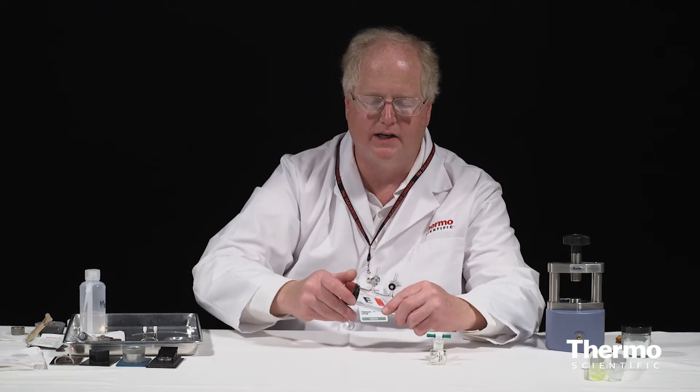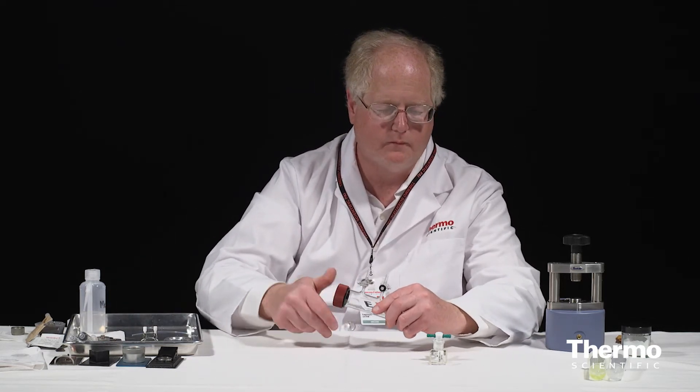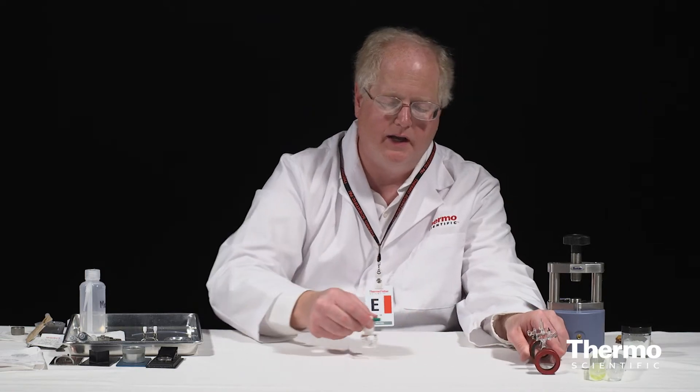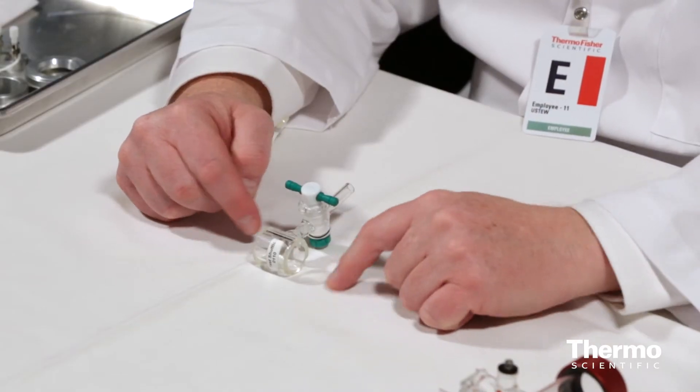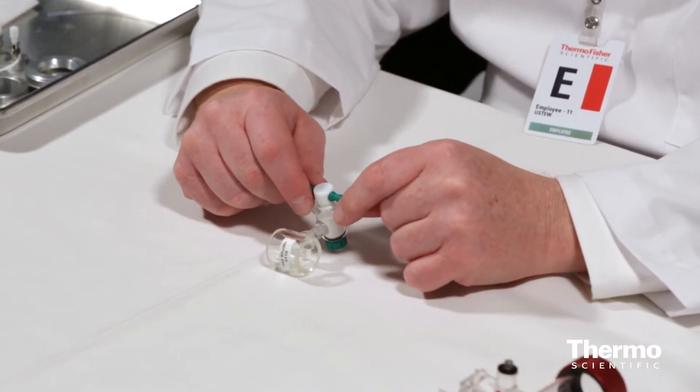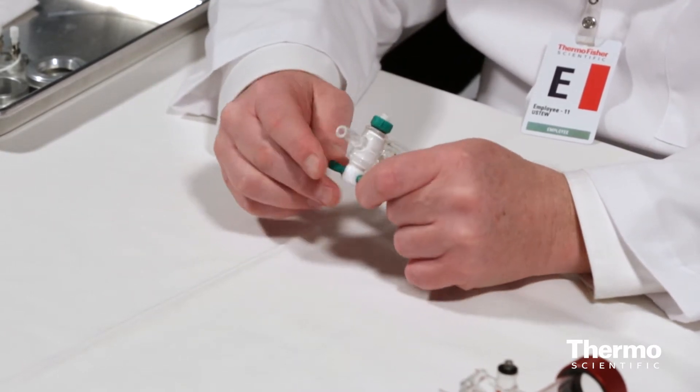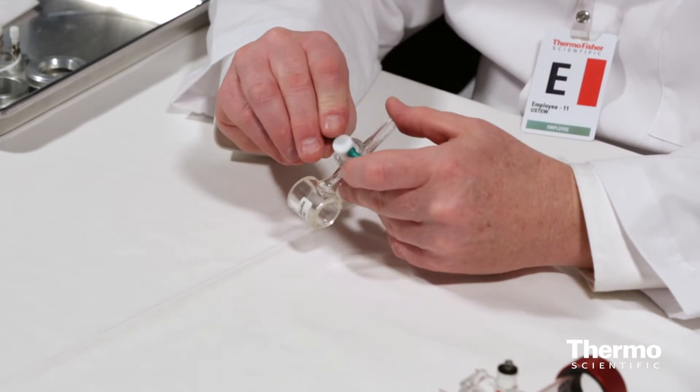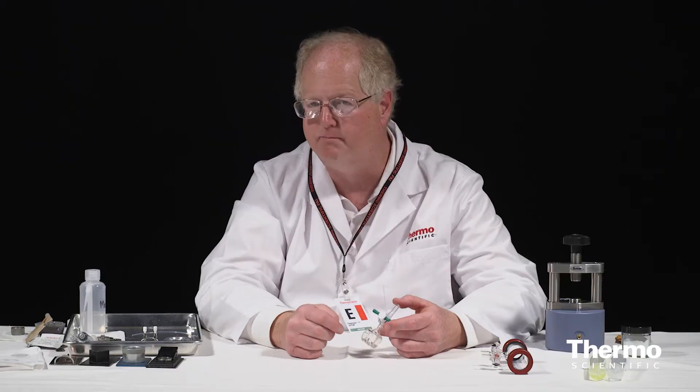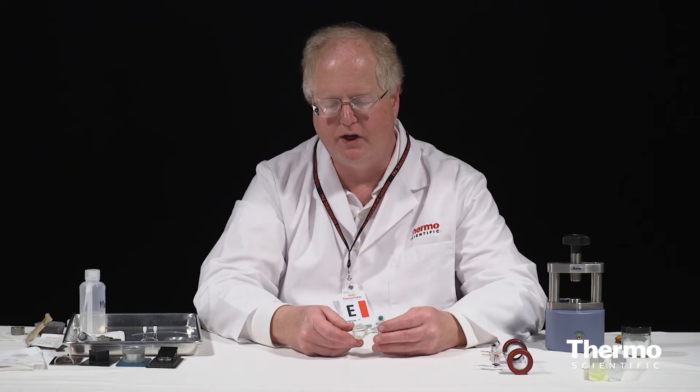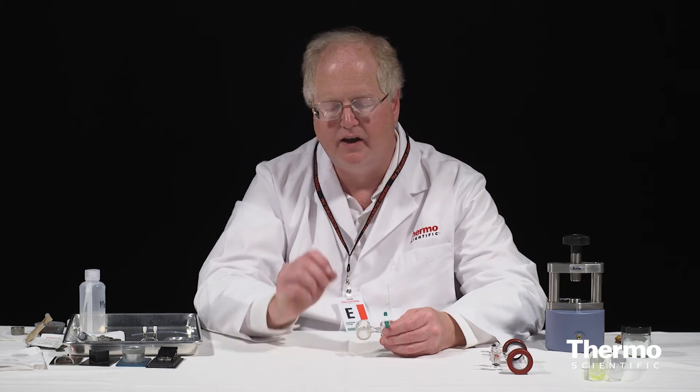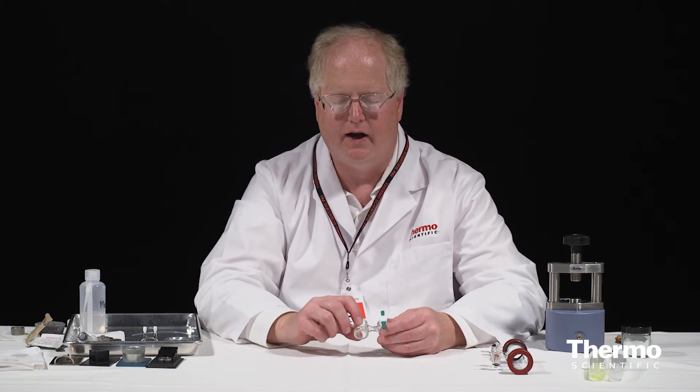We're not going to be using that cell. Instead, what we've got is a very simple cell in which the windows have been sealed on. They've actually been epoxied on. The overall path length of this cell is well known. And then this cell has been filled at our manufacturing facility with carbon monoxide, which we are going to use as a high resolution sample.